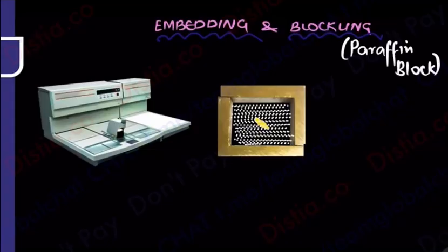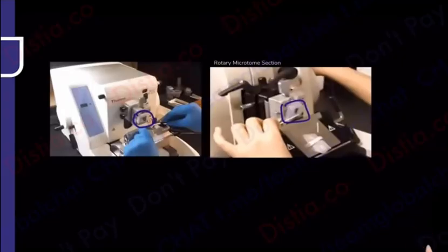What are you going to do now? You will say, ma'am, the tissue is ready. Now you just cut it and you put some blue, pink, your favorite pathology colors onto it, and let's look at it under the microscope. So what are you doing over here? You've got a blade over here, and with this blade you are rotating. Can you see this pathologist's hand on the side? You're going to rotate and this is going to cut and come out. You can see the paraffin gradually getting cut.